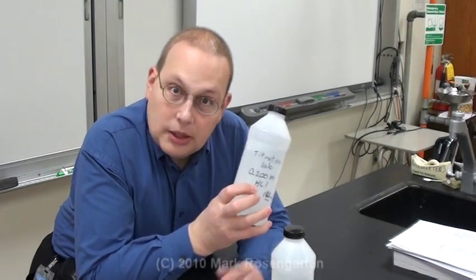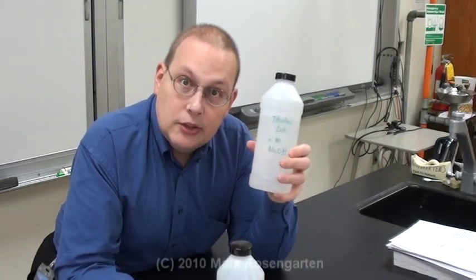Now, hydrochloric acid has one H in the formula. Sodium hydroxide has one OH in the formula. So that's easy enough. And we know the molarity of the acid, MA. That's 0.100 molar. We don't know MB though. That's what we're trying to find out.